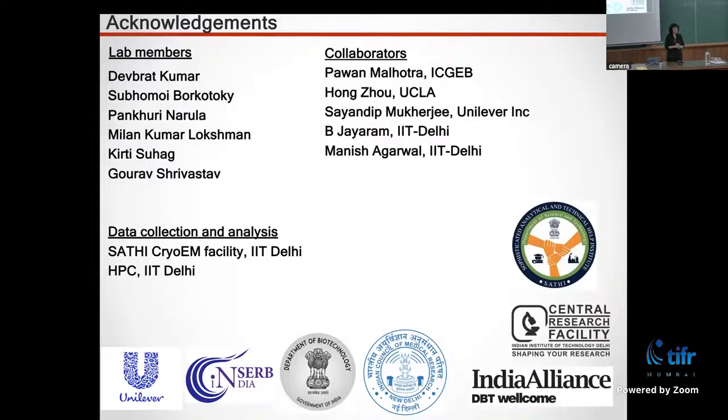So this is a possibility, but the resolution is still very low for all of these studies, and there are a lot of reasons for it, everything from sectioning issues to electron damage to not being able to find orientations. There's a huge number of issues, but hopefully these can all be resolved at some point. So it's not too futuristic, maybe in the next 10 years.